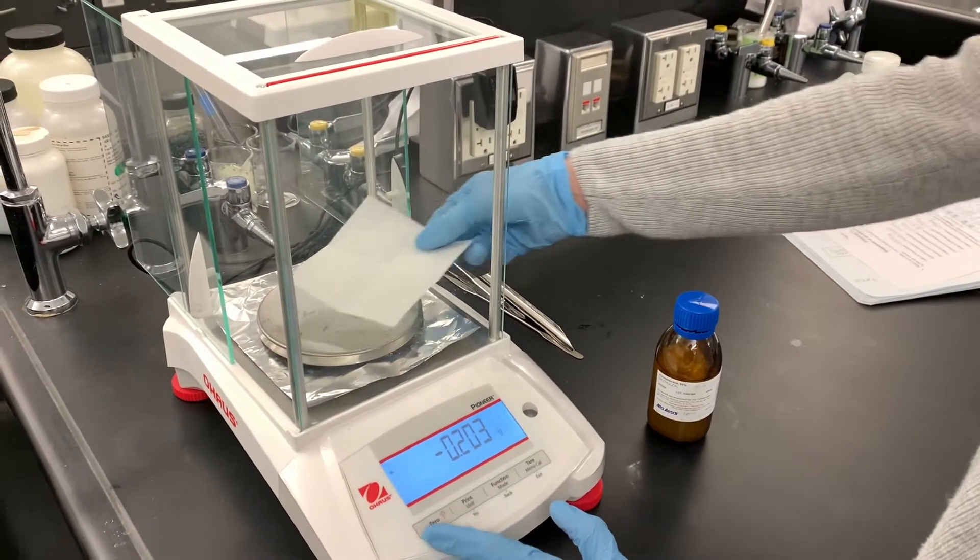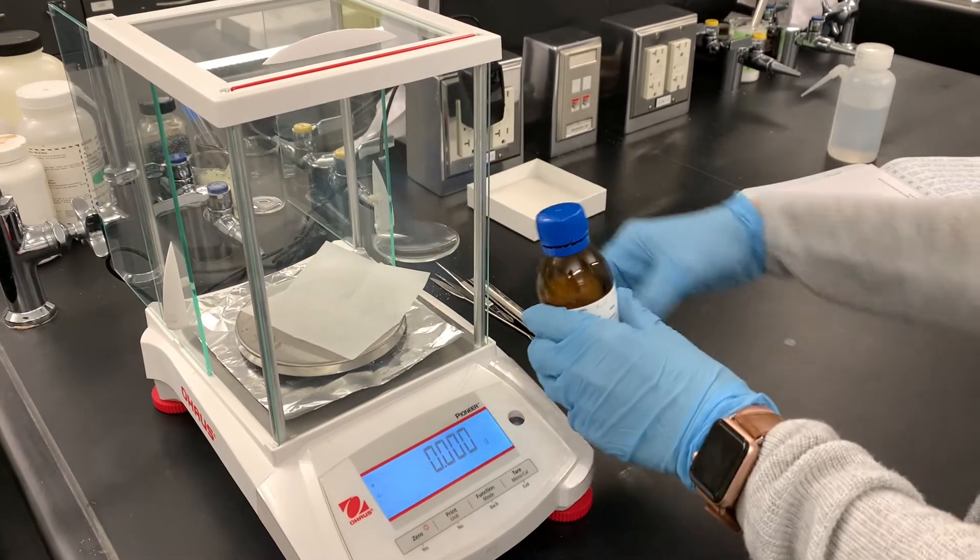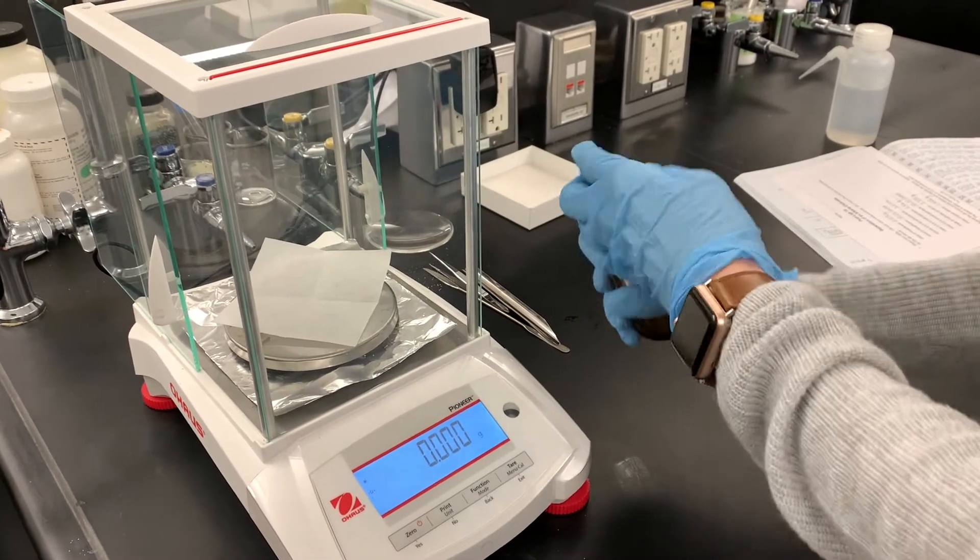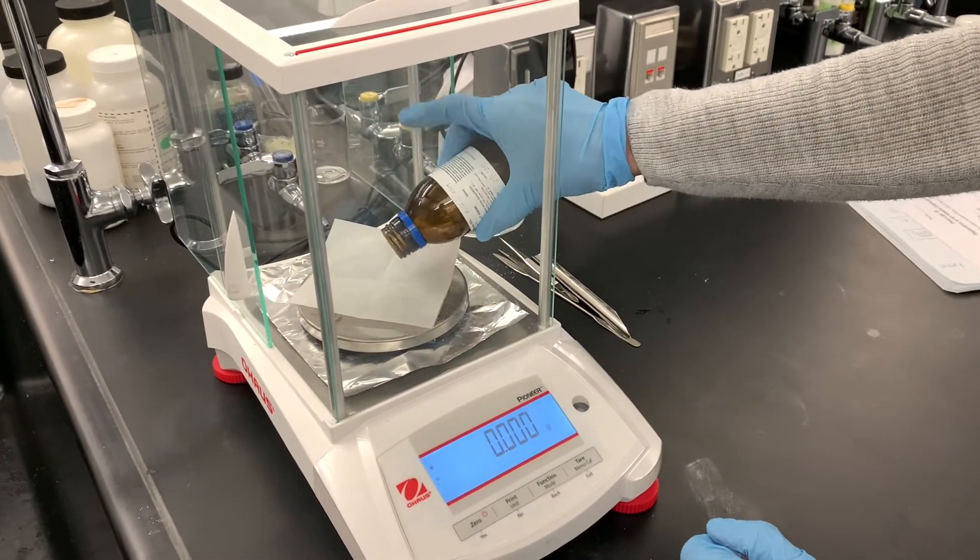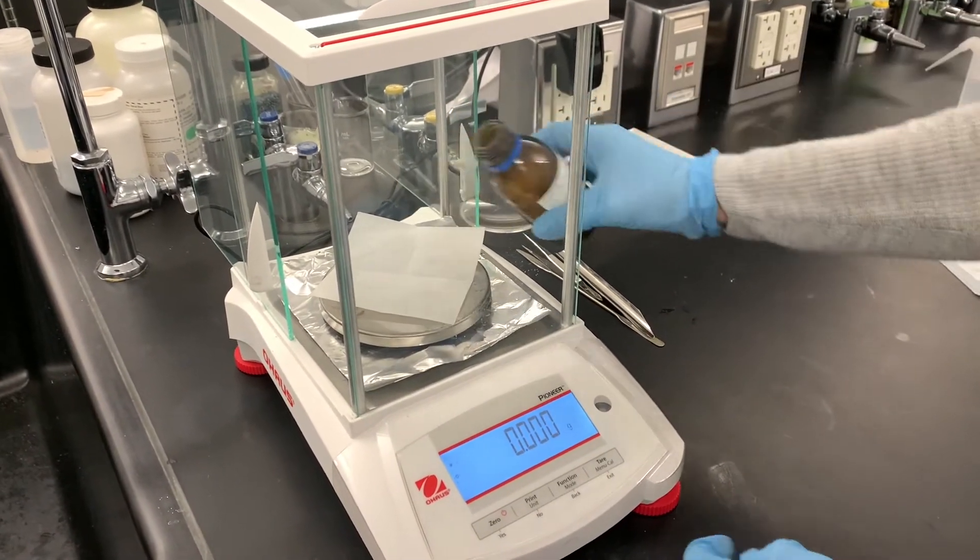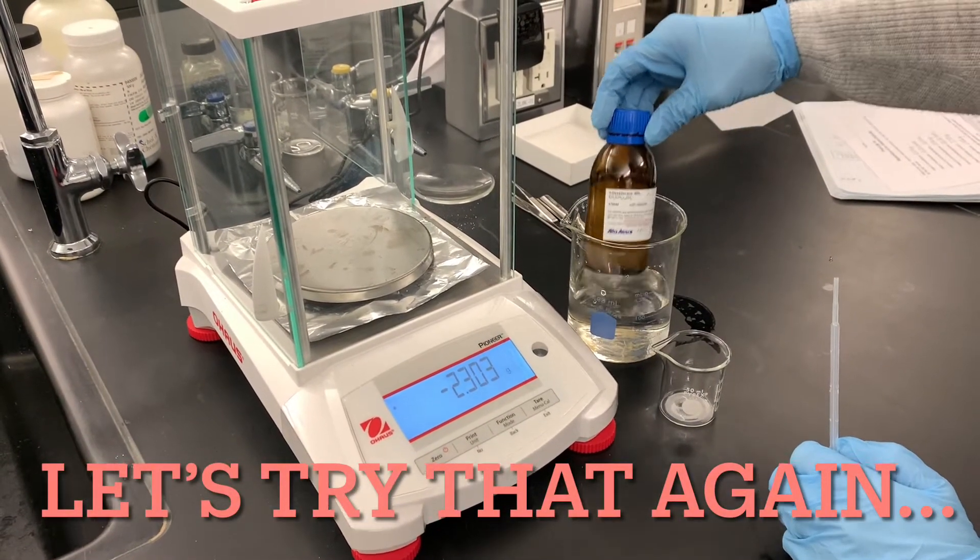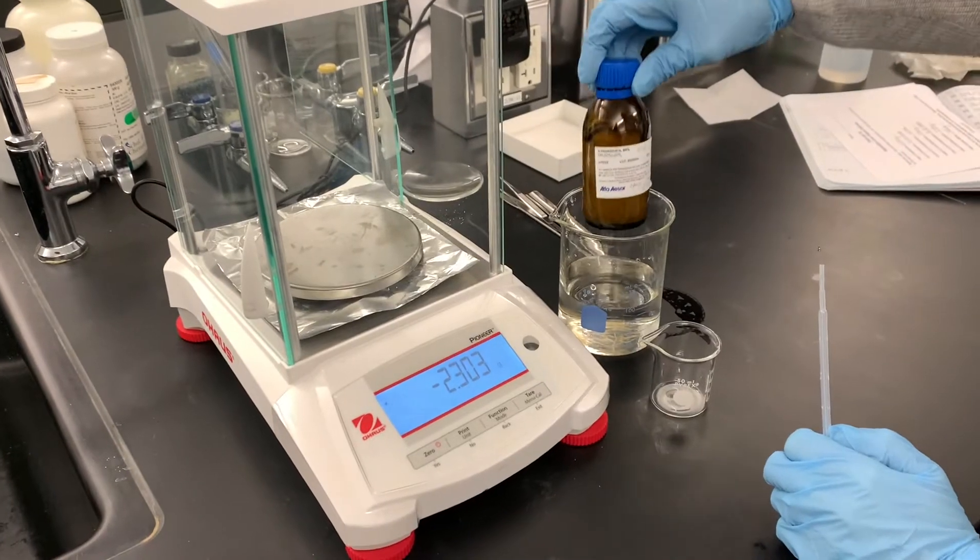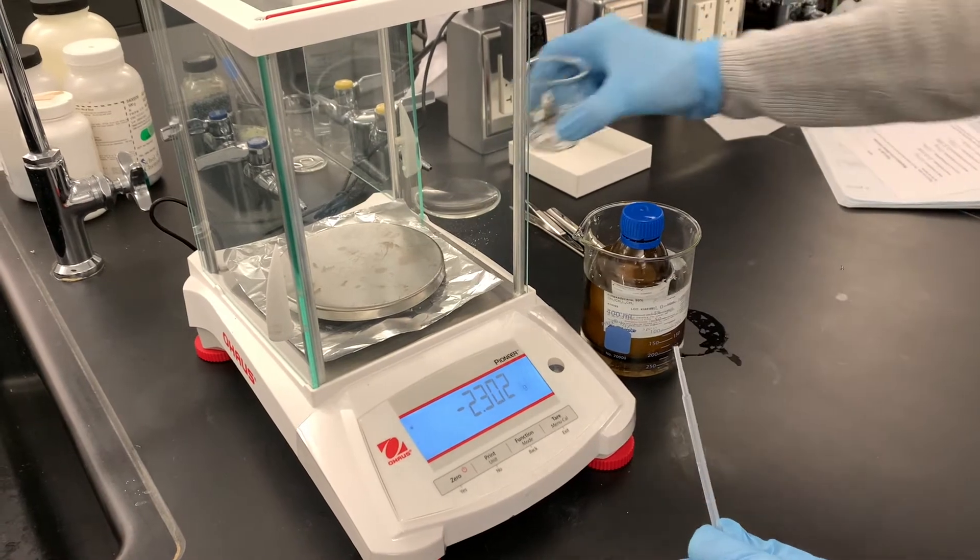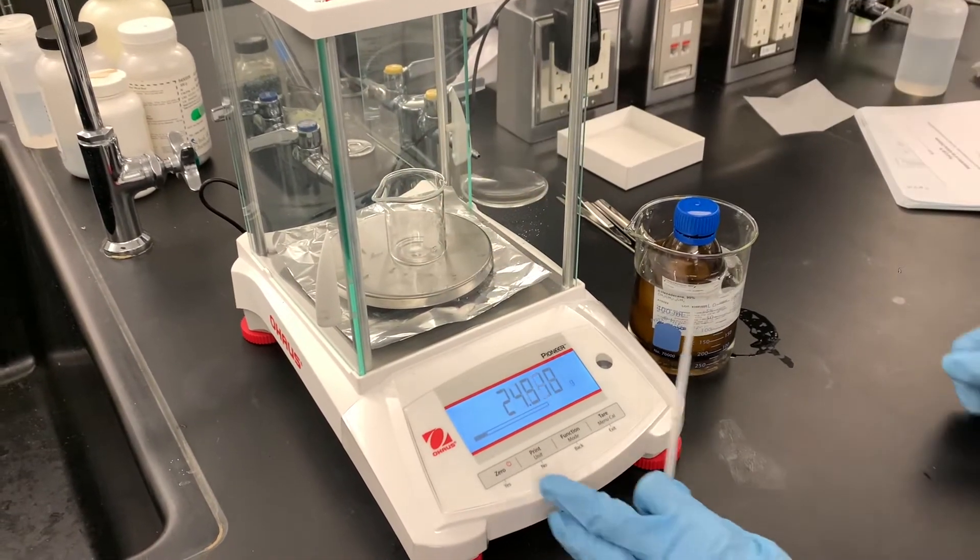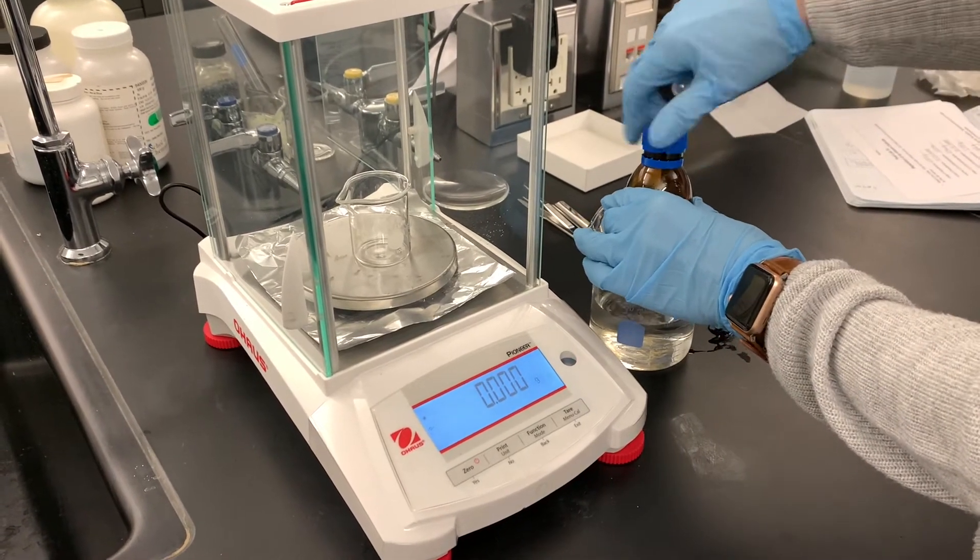We're going to be starting with about 2.3 grams of hexadecane. Hexadecane's freezing point is right around room temperature, so I have it in this beaker of warm water. It's just helping it melt. We're going to measure it right into this 50 milliliter beaker.